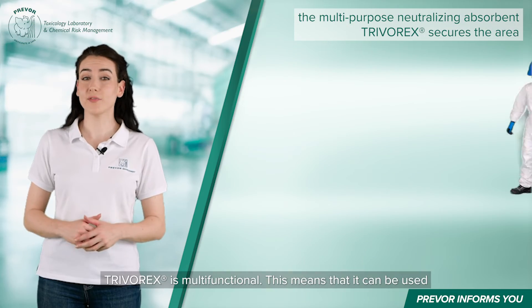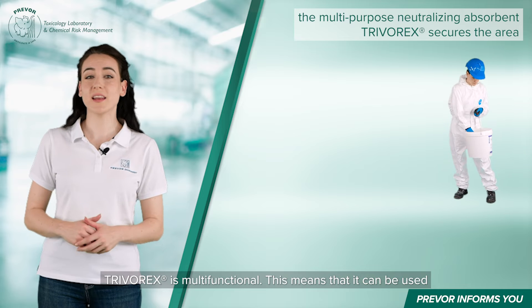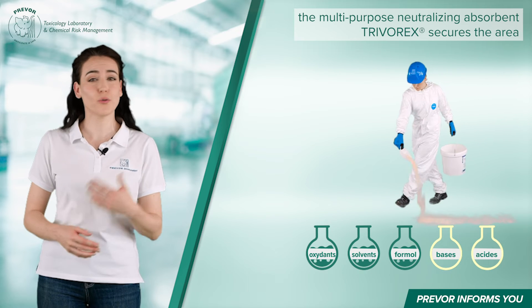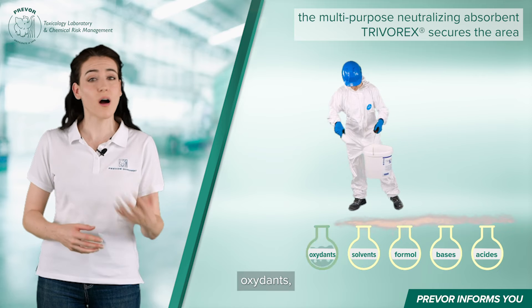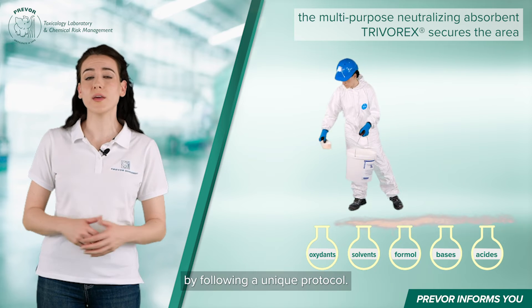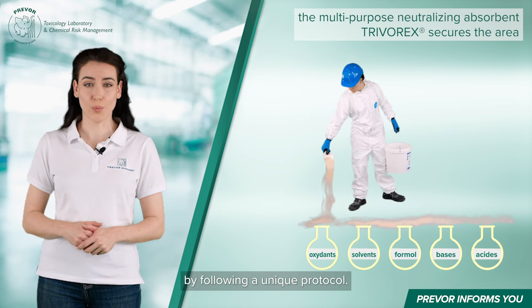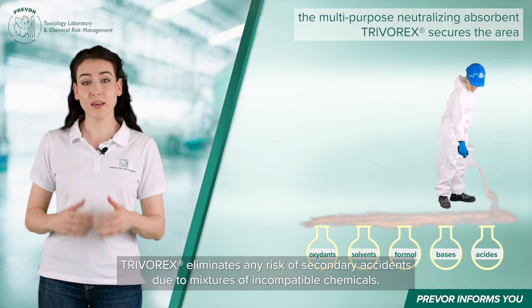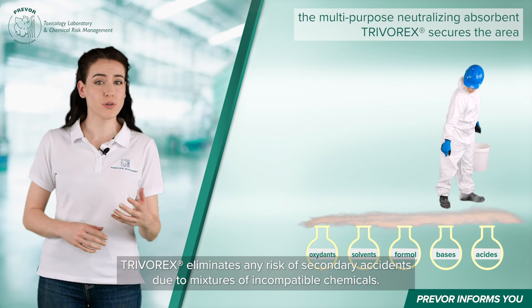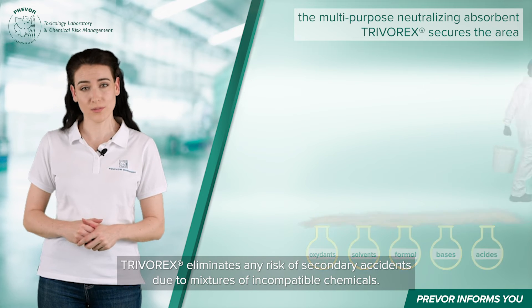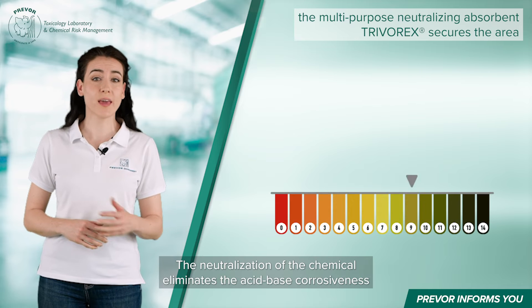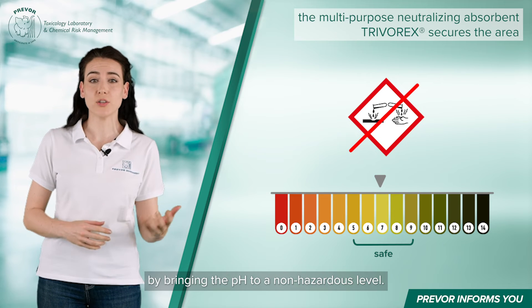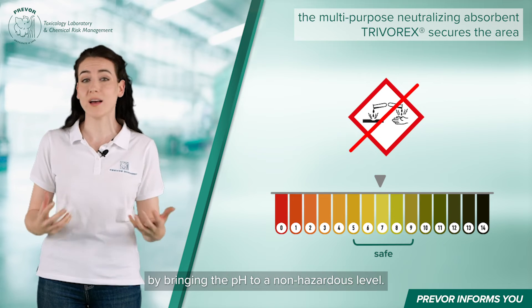Trivorex is multifunctional. This means that it can be used on all your chemicals — acids, bases, formaldehyde, solvents, oxidants — by following a unique protocol. Trivorex eliminates any risk of secondary accidents due to mixtures of incompatible chemicals. The neutralization of the chemical eliminates the acid-base corrosiveness by bringing the pH to a non-hazardous level.